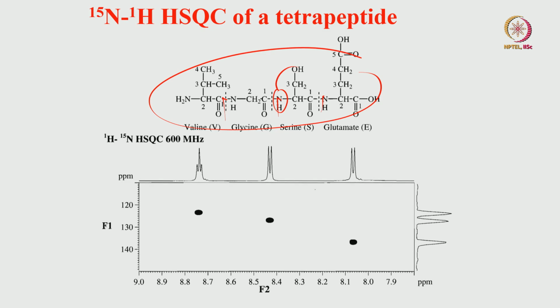Then you can identify the chemical shift of the nitrogen and correlate those NH peaks to the corresponding proton chemical shift. If you have a bigger molecule like a protein, there are n number of protons, and you get a huge, complex HSQC spectrum, and we can start interpreting each of them. And this is a simple example of this case.